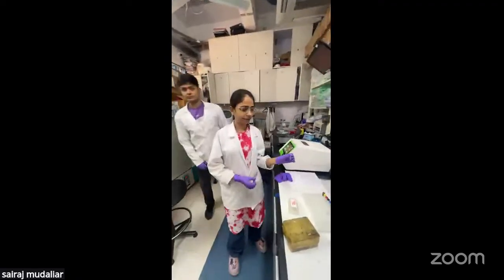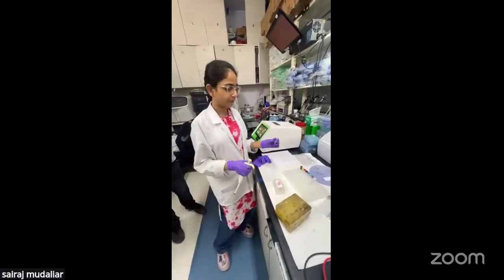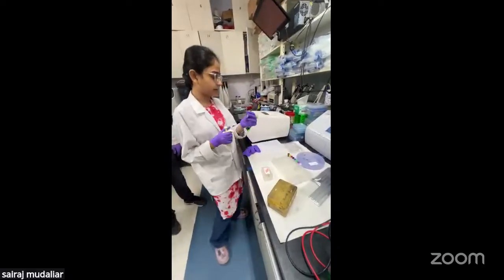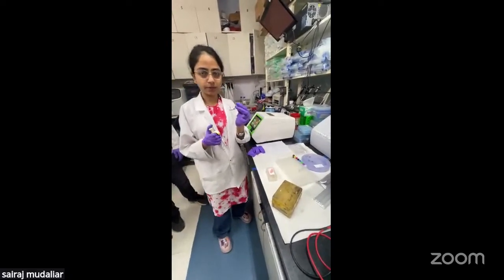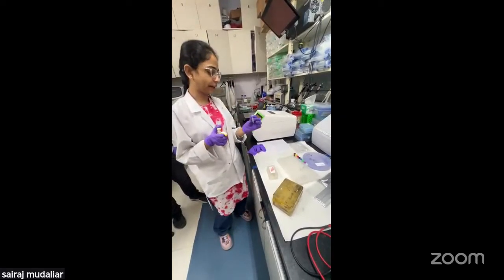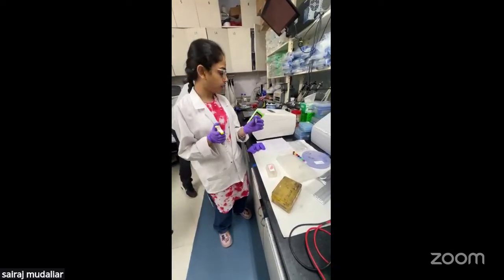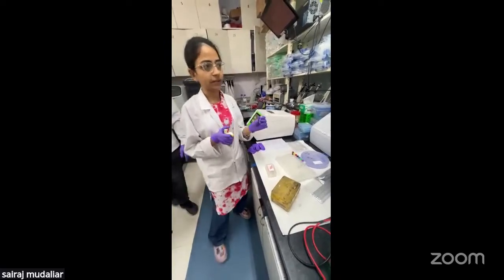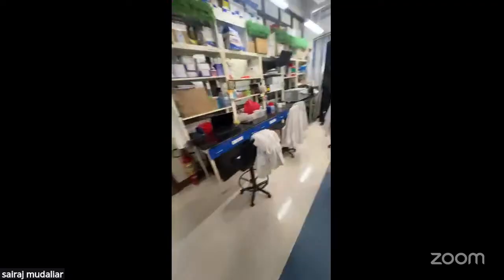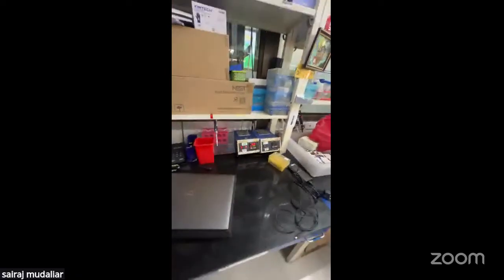My name is Khushi Tiwari, and we are doing digestion. We are using proteomics-based digestion. So here is our tissue sample, and in this we take 100 microgram of tissue sample, and we add 50 microliter of lysis buffer and incubate at 95 degrees Celsius for 10 minutes. And here we put 95 degrees Celsius. So we just incubate the samples at 95 degrees Celsius.